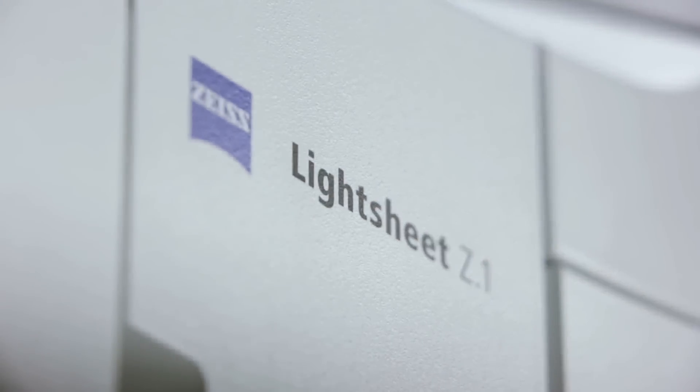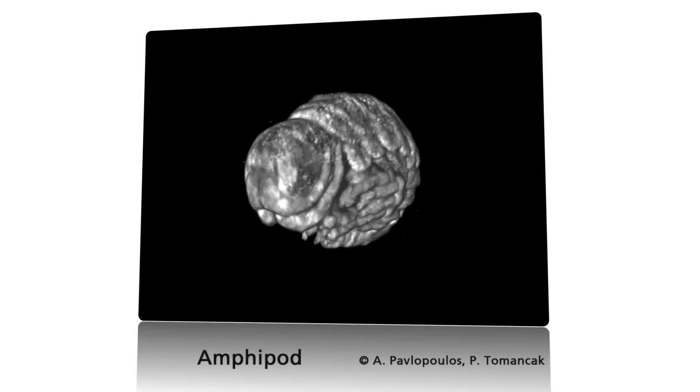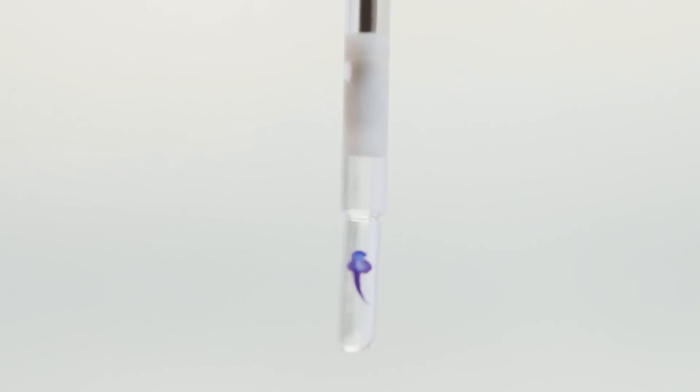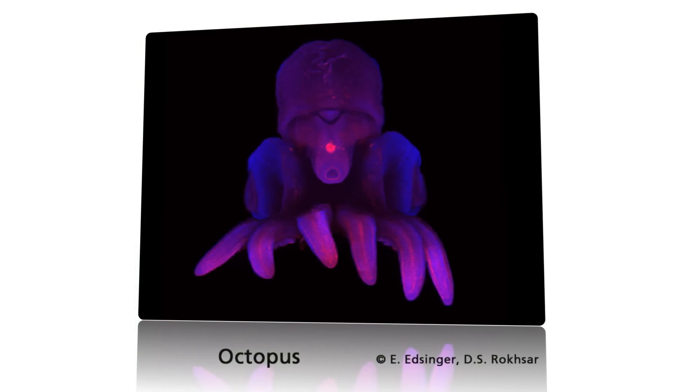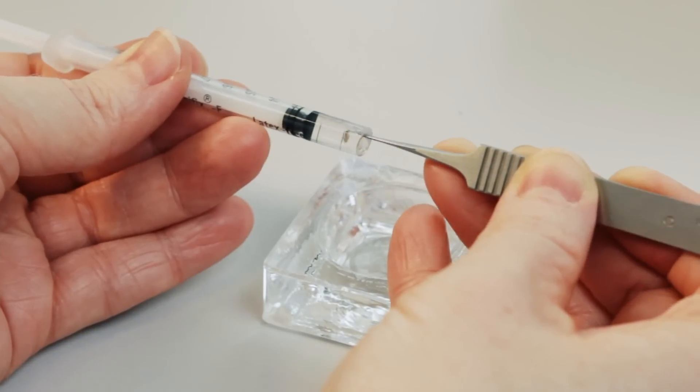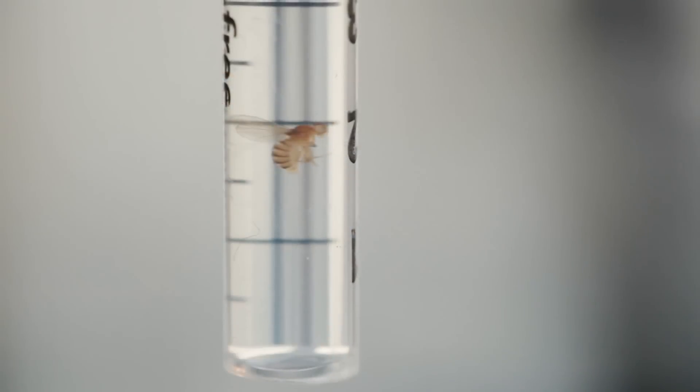One big advantage of LightSheet Z1 is that three-dimensional specimens are not confined to slides or petri dishes, but embedded in a clear gel. The developing organisms benefit from having just the right physiological conditions and next to no mechanical stress.